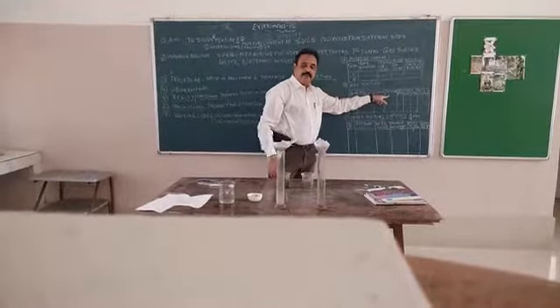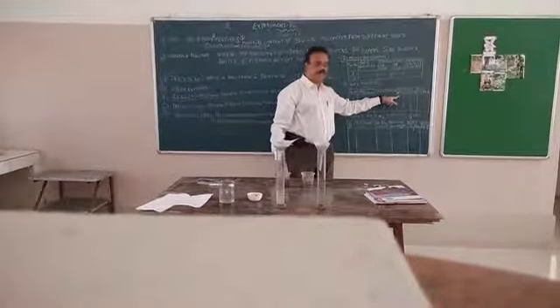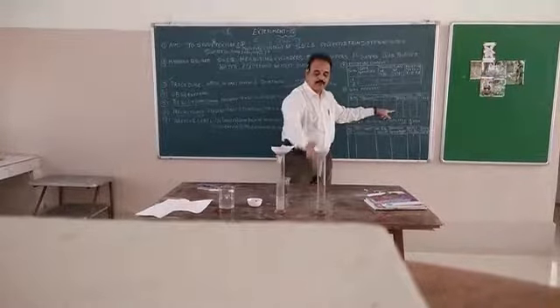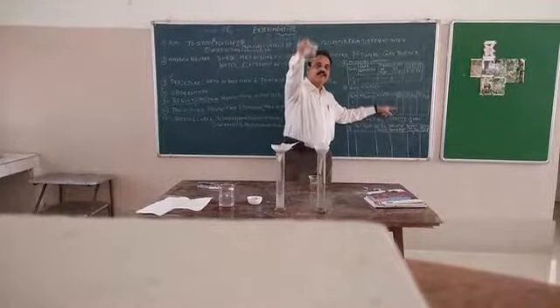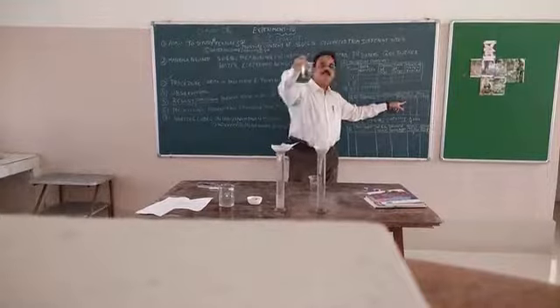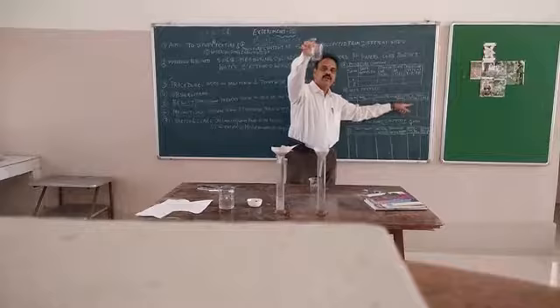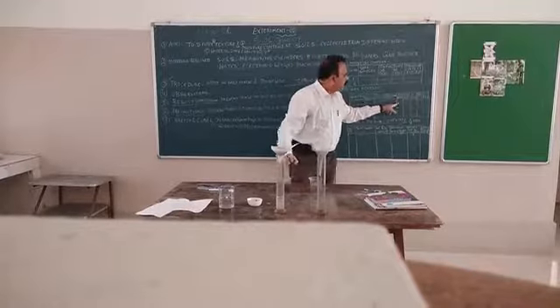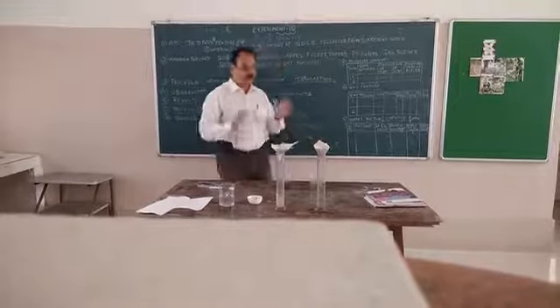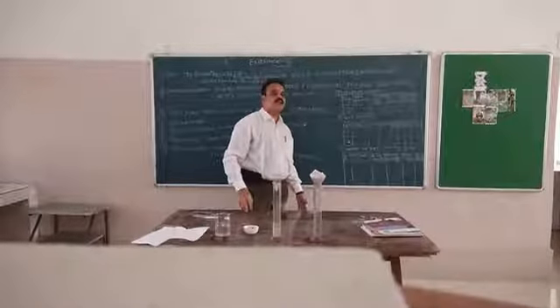Second, texture. In the texture, what are you going to see? The relative percentage of sand. Like in this, the highest percentage of sand is there. Just by seeing it, you will come to know. In this, sand is very less. So write the percentage of sand. Then silt, which is neither too smooth nor too rough. And clay, of course, the very smooth one. Then based on the percentages, you write which type of soil it is. For this, you require the background of the organisms and populations chapter theory.